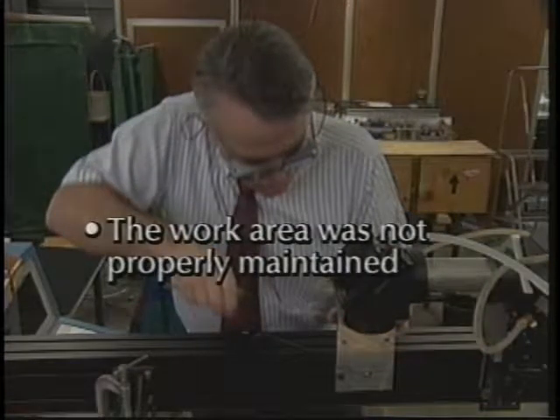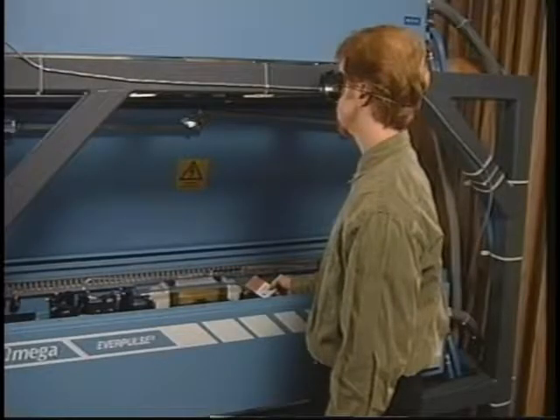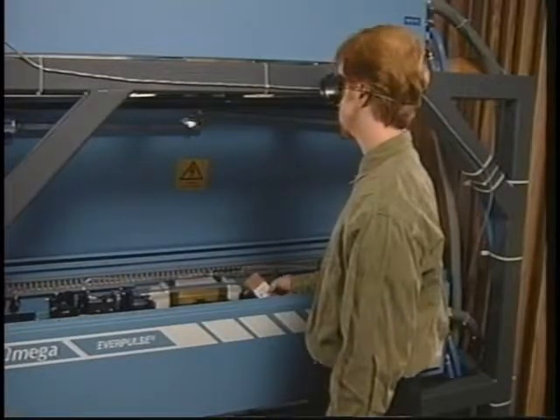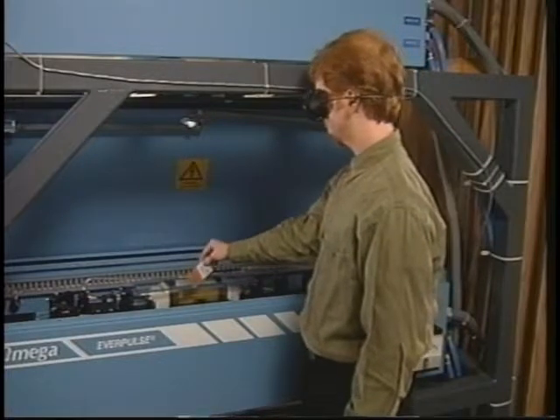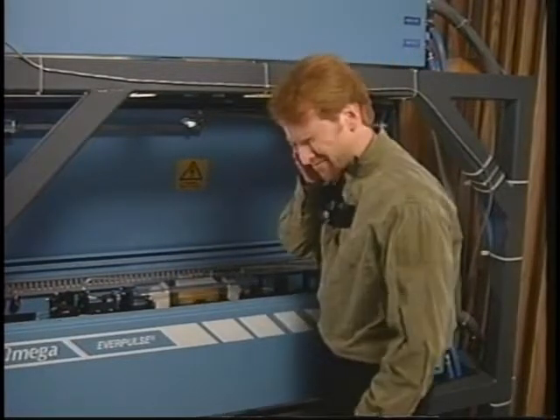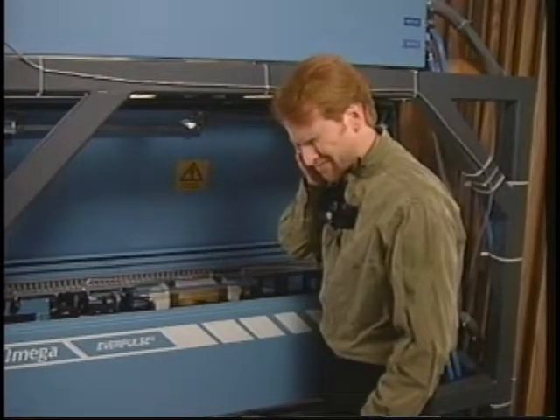Remember to put all tools away. They are potential reflectors of laser beams. At the operational wavelength of carbon dioxide lasers, even dull metal surfaces may serve as specular reflectors. Keep the area as clean and clutter-free as possible. This technician is performing routine beam adjustment on a neodymium YAG laser. The laser beam is invisible. Why do you think this accident occurred?